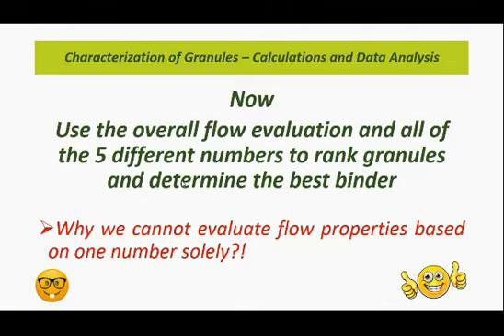Based on flow rate, simply particles with a higher flow rate value will have better flow, while moisture content evaluation should be done with respect to moisture content of lactose.